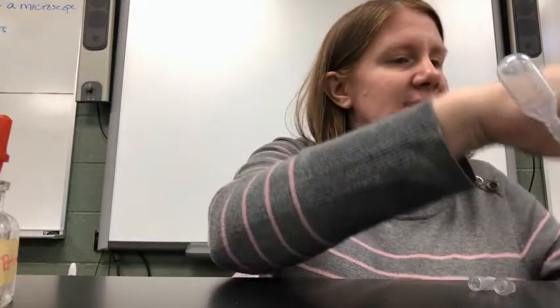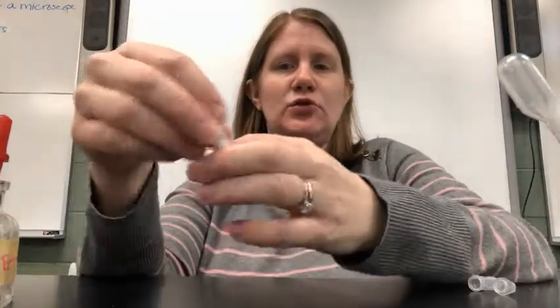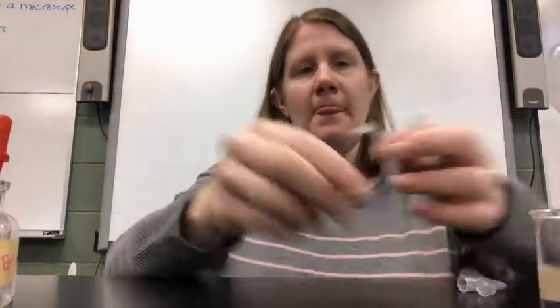Okay, going on to suspect 3. So sample from the envelope, empty tube. Put the rubbing alcohol in there. Get a little bit of the sample.